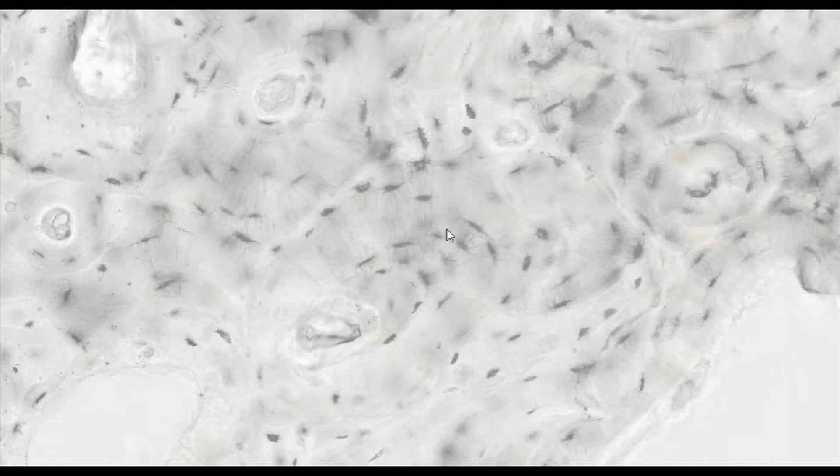Between the lamella there are lacunae occupied by osteocytes in the living bone. The used dye, gentian violet, in addition to lacunae, also fills the tubules that connect all the lacunae in the osteon.